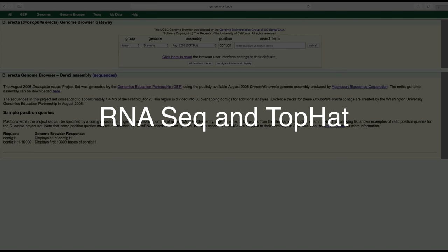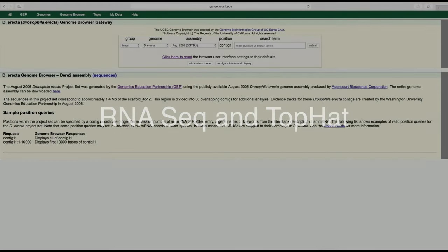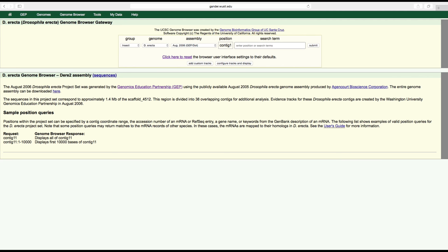The genome browser contains tracks that we can use to visualize regions of the DNA that are transcribed into RNA. This type of data can provide strong supporting evidence to the hypothesis that a certain region of a genome codes for a gene.